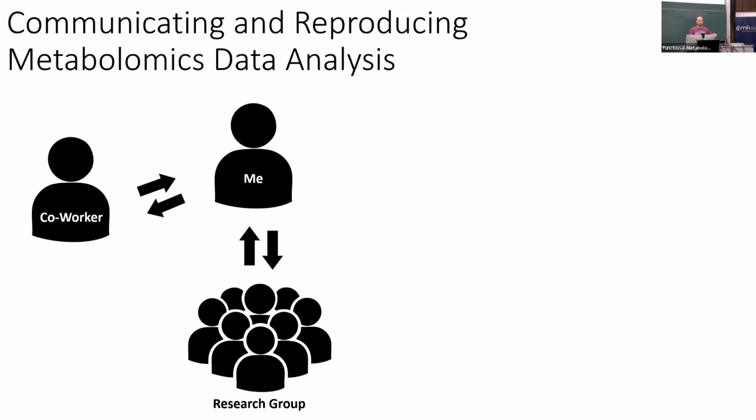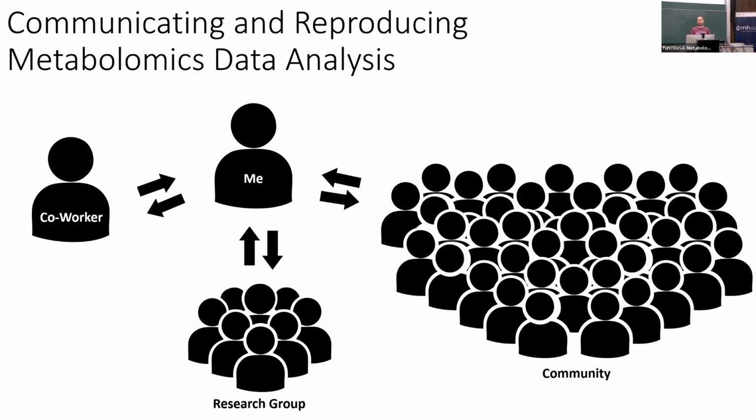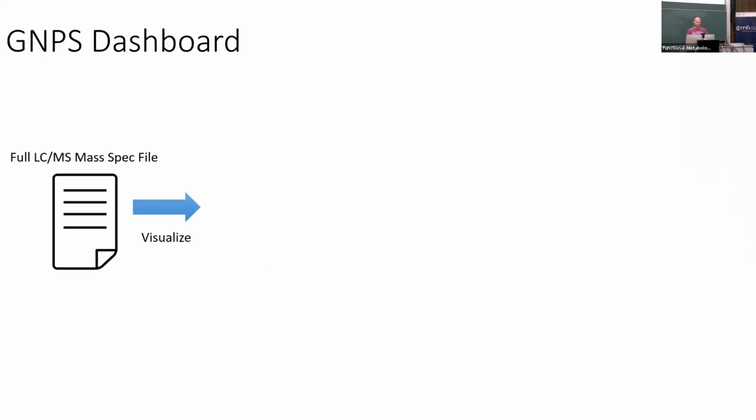Same within the lab, and then particularly once we go to the community, reproducing things there, I think this is hard, and bringing everybody onto one page is also hard, because obviously there are many different ways and many different opinions. So now, what's the concept behind the dashboard?